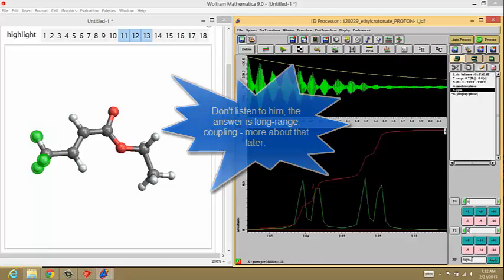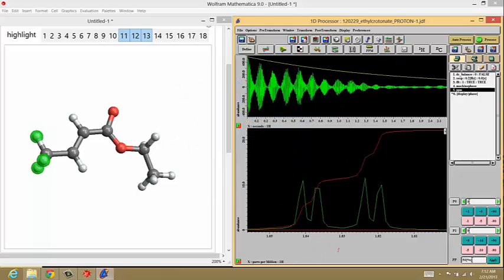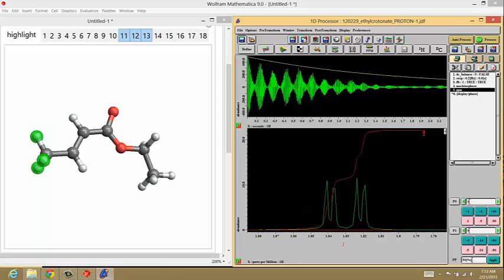We'll discuss that in later videos. But we see 2 main features here. We see 2 peaks, and this is consistent, although granted, because we see some additional features here, it's not as unambiguous as the first one. What is suggestive is that this CH3 group is the peak that shows up at 1.83. Okay.